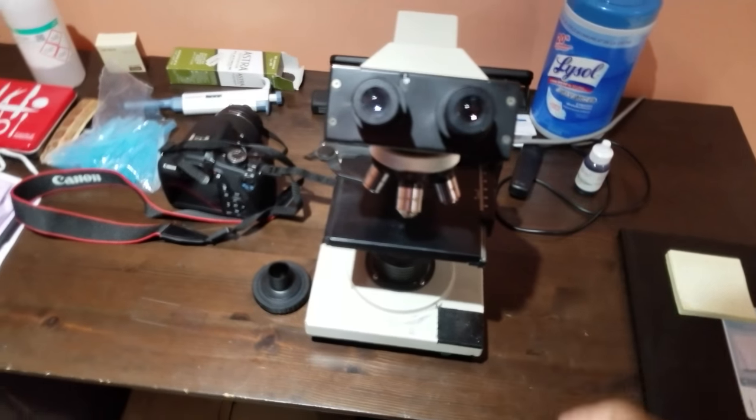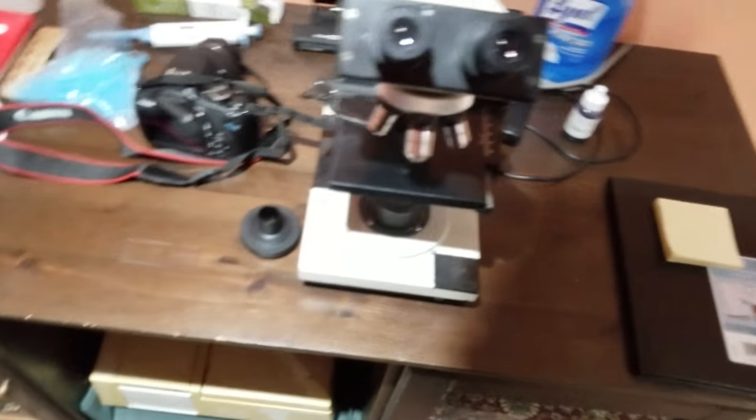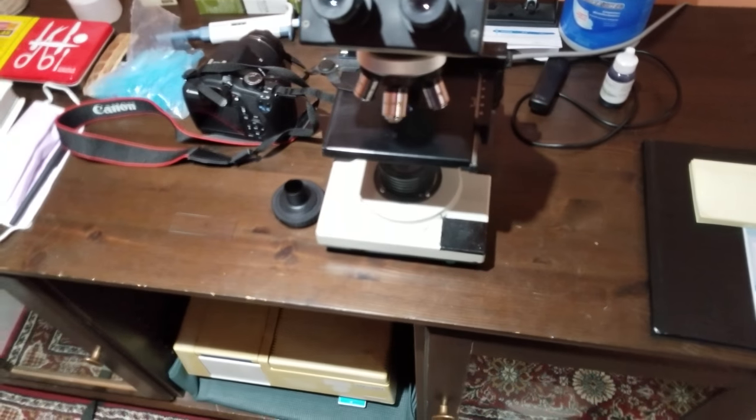And if you want to look at something like a specimen right away, then you also want to have your slide ready. But we're not going to be doing that today. We're just going to be showing you how to use the camera.